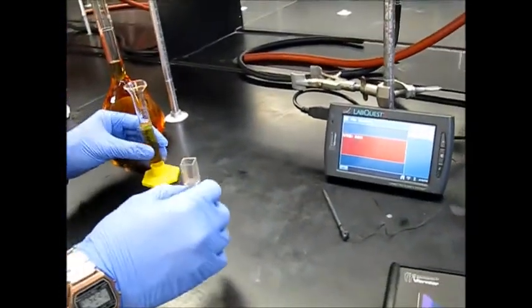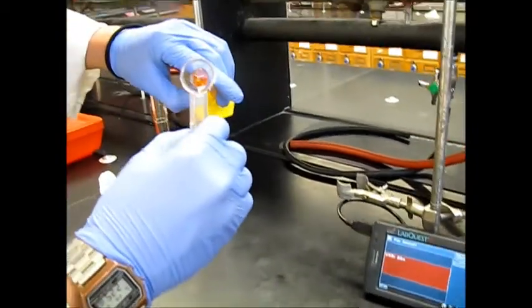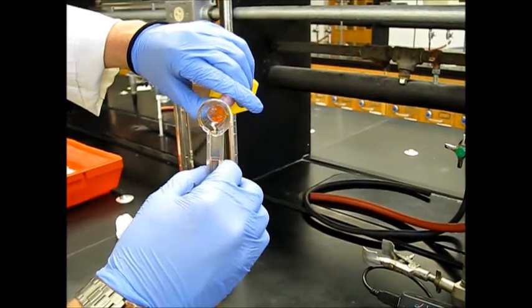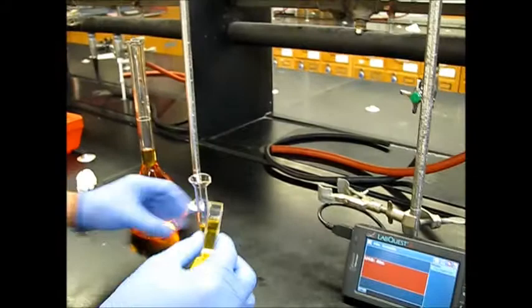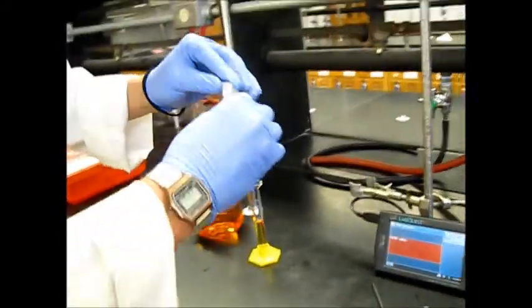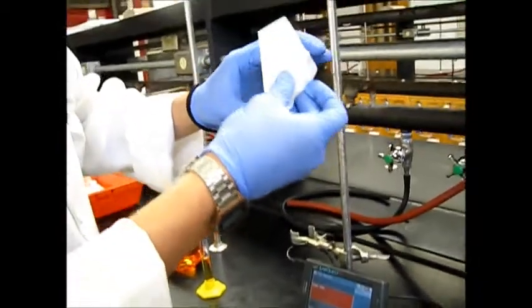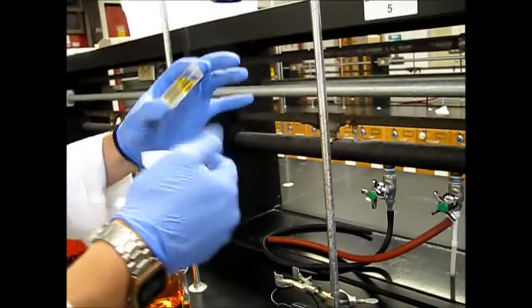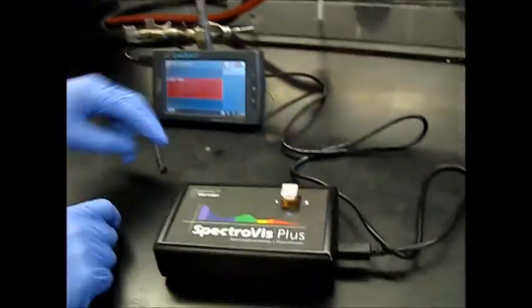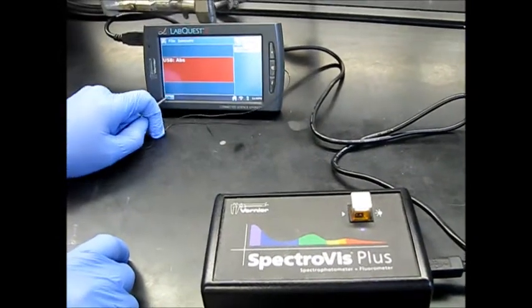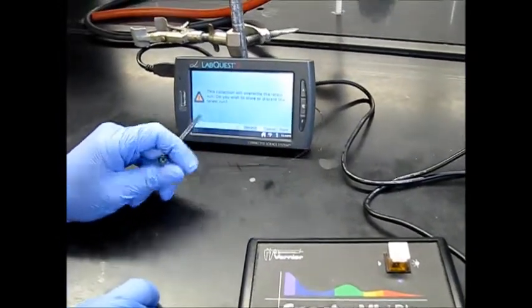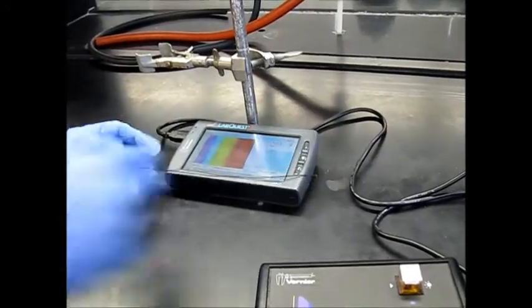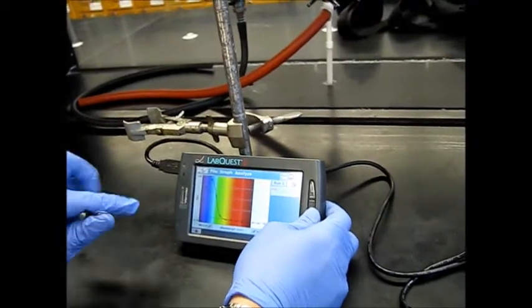So now that we have our blank set, we'll go ahead and fill this cuvette about three-fourths of the way full with our solution. Place our cap on, and then again, we want to use our chem wipe.